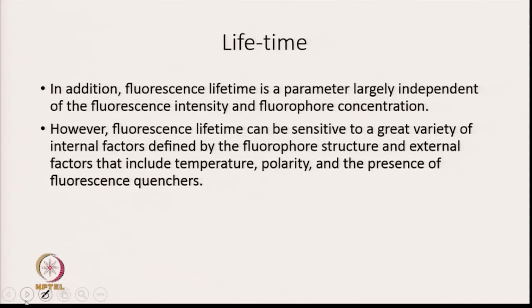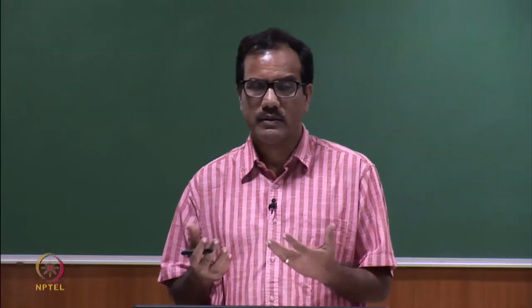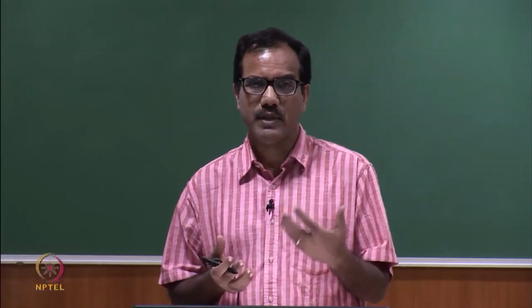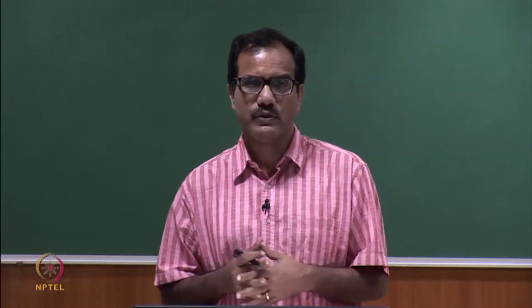In addition, fluorescence lifetime is a parameter largely independent of fluorescence intensity and fluorophore concentration. So, it does not matter what concentration of fluorophore you start with, lifetime is going to be the same. Again, this is in contrast to fluorescence intensity.